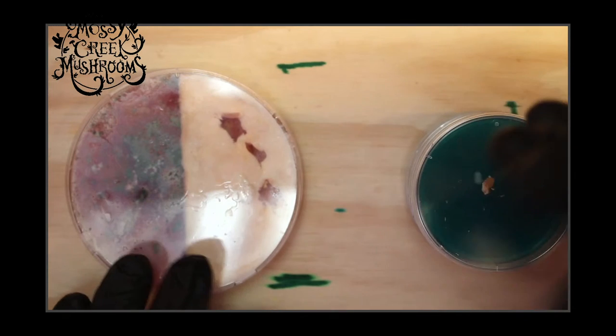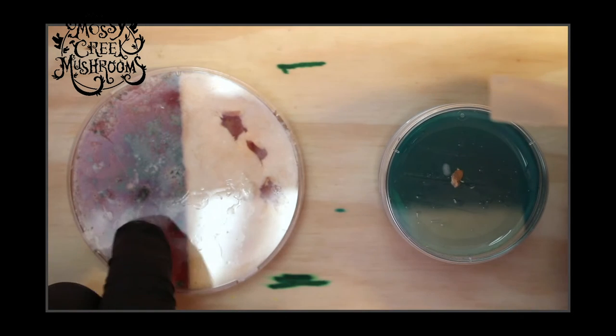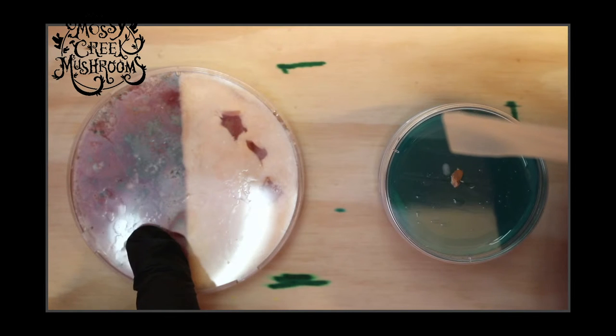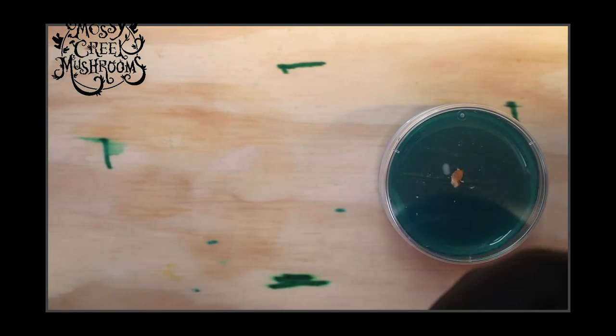Real quick — last week I said that I always do my new plates first because I'm trying to protect those. This plate's dirty, this plate's filthy. When you're working with contamination, oftentimes the rules are kind of reversed. It's easier to keep something clean than it is to clean it.